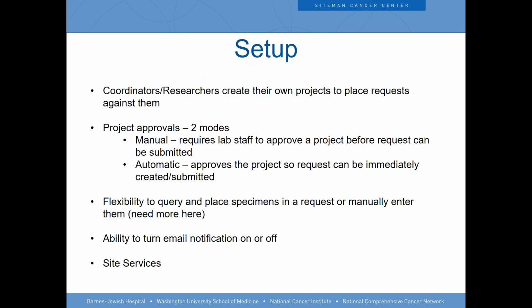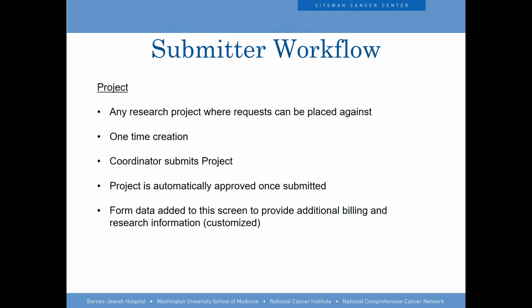And we'd be happy to provide this. It's nothing secret. We could provide the file that we use that generates this form as a starting point if somebody wants to make modifications to it. But you can see it's very specific to our core. But again, sometimes it's easier to have something to start with than just fresh, which is nothing. You kind of have to start somewhere. So that's what that looks like. The setup is pretty easy.